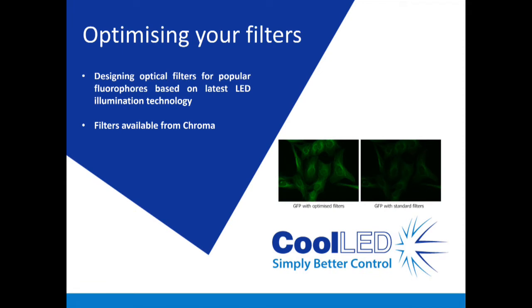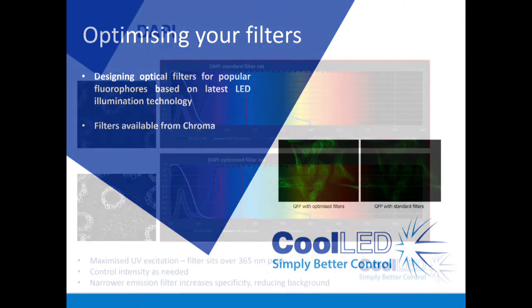Although LED illumination peaks are designed around the most popular fluorophores, using the right filters can make all the difference when it comes to achieving detailed fluorescence images with a high signal-to-noise ratio. However, many standard filters are not optimized for LEDs, and we'll run through a few examples to explain how optimized filters lead to significant improvements in image quality and accurate experimental results when using our systems.